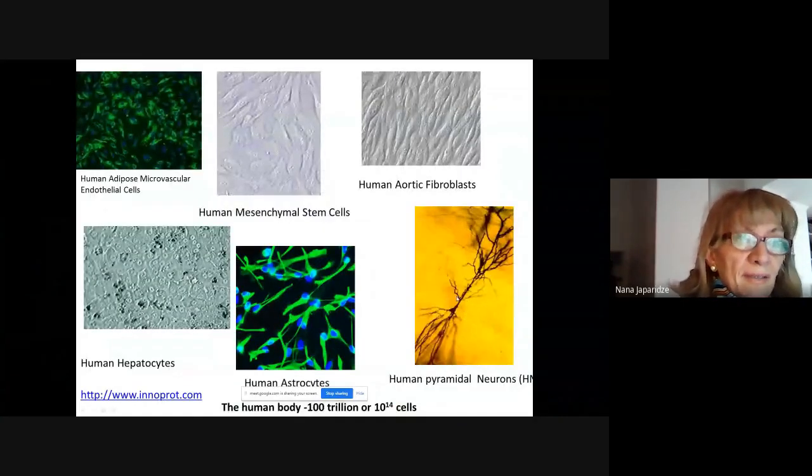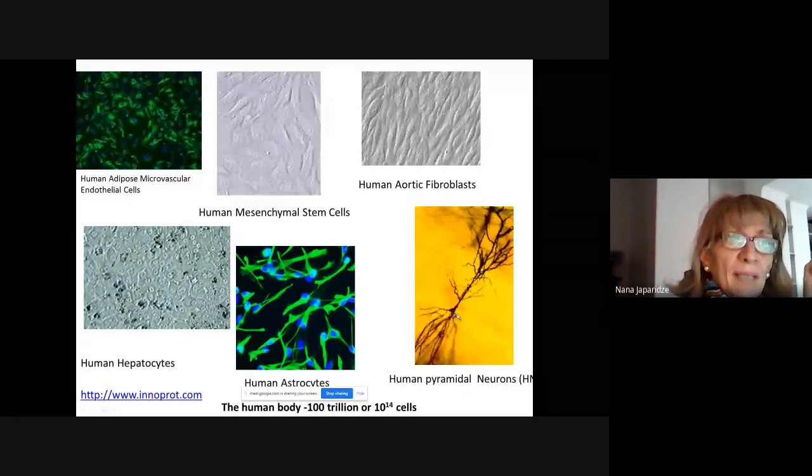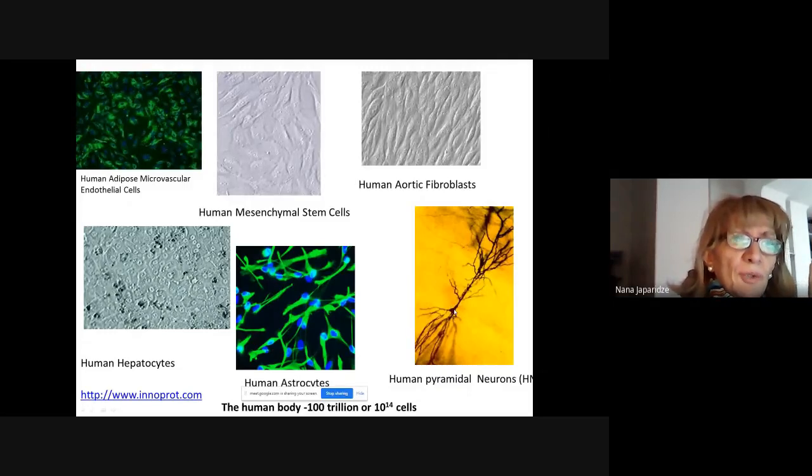Look, this is a neuron, a pyramidal neuron, a human pyramidal neuron. This is the cell body. Do you remember cell bodies of the spinal cord, which you saw on previous slides? And here you see also the processes of these cells. Look, dendrites here and there.